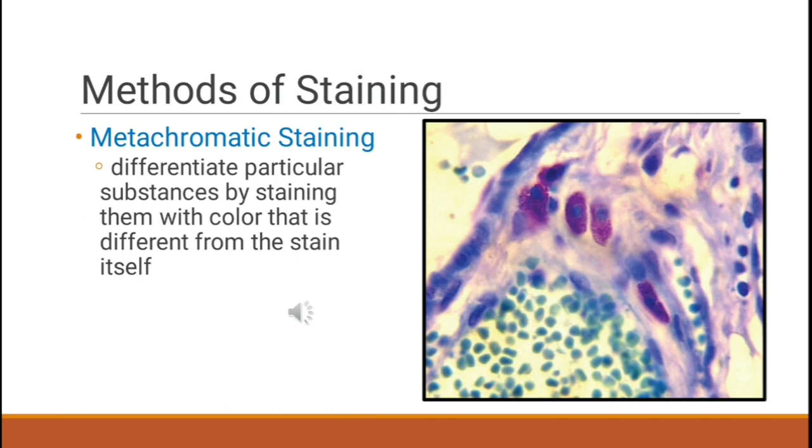So the color shift is always from a blue or violet dye to a yellow or red stain, meaning that the color absorption shifts to shorter wavelengths, leaving only the longest wavelengths to be seen. This is believed to represent polymerization of the dye. The greater the degree of polymerization, the stronger is the metachromasia.